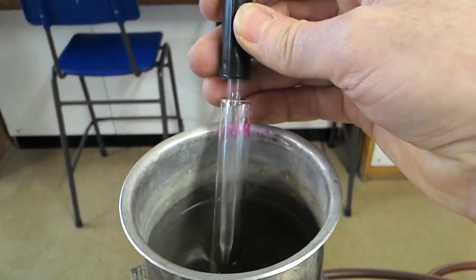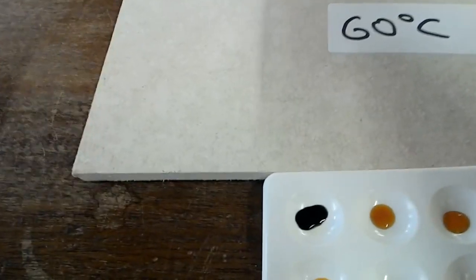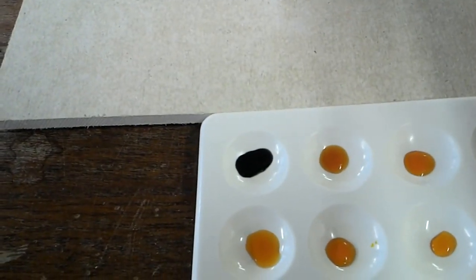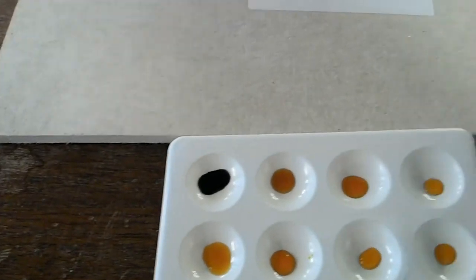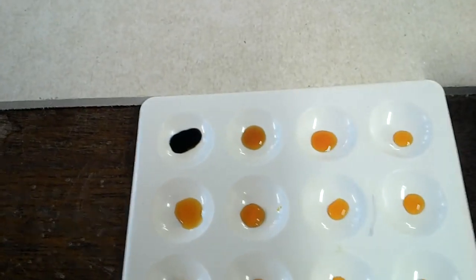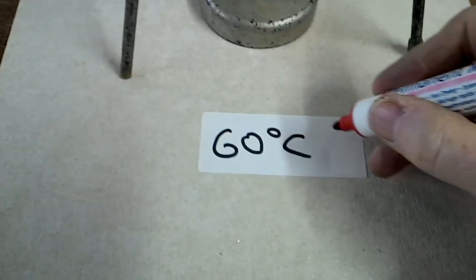Okay, 5 seconds to go. Let's take our next sample out. Ready? Here it comes. Bang. It's hardly changed. Hardly changed. I think we can call that it. So really, this one is done by 30 seconds. Sorry, this happened in half a minute.